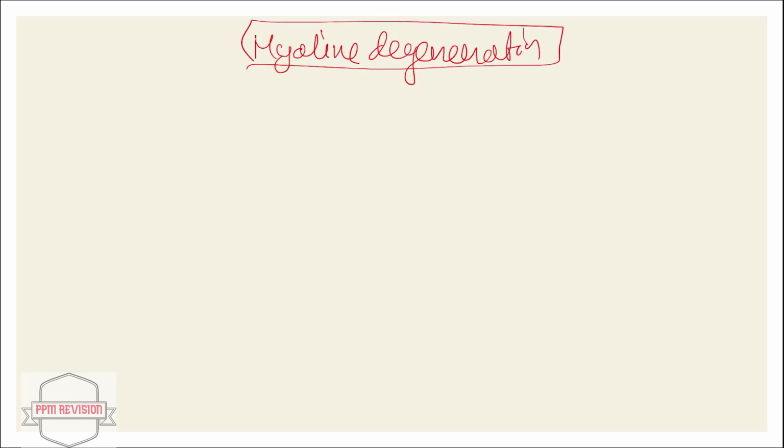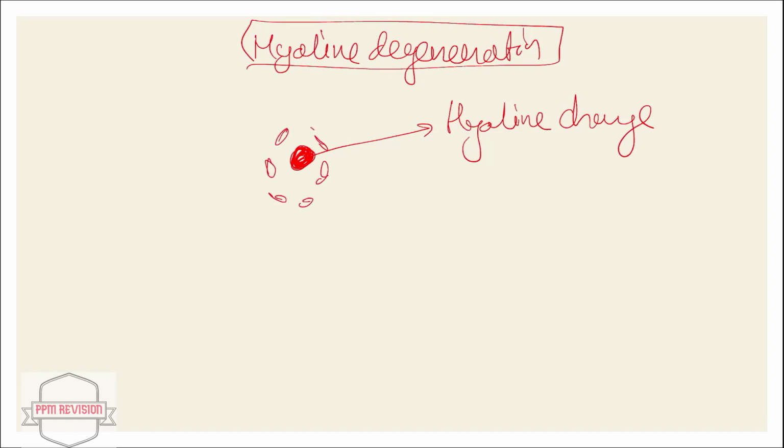So now moving ahead, we'll be looking at something known as hyaline degeneration. So we have it here. This is nothing but the hyaline degeneration. Looking at the points, this is nothing but the HD, hyaline degeneration. Firstly, we have the hyaline change. In case of hyaline degeneration, we can see the hyaline change. This is important. Then moving ahead, we have something called the whorled pattern, right?